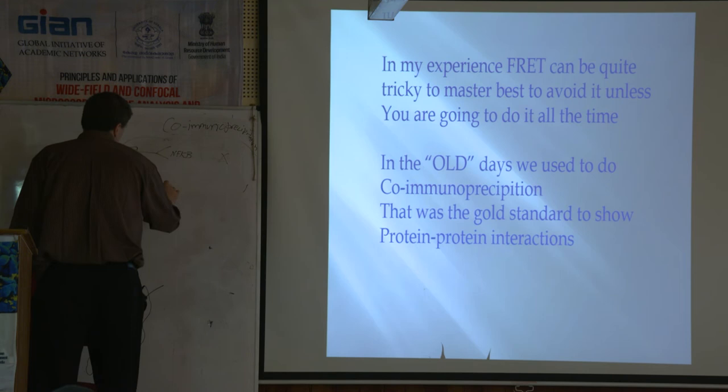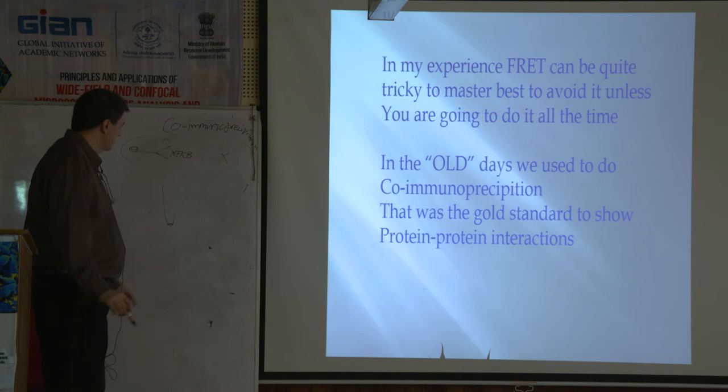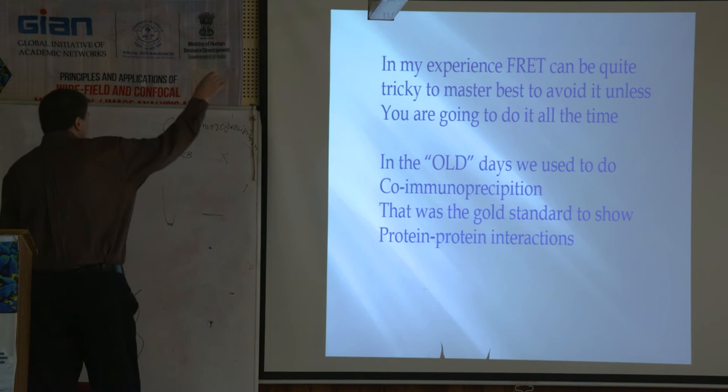We could pull it out. We could run it on a Western blot. And then probe back with this and say, okay, we got NF-kappa B.